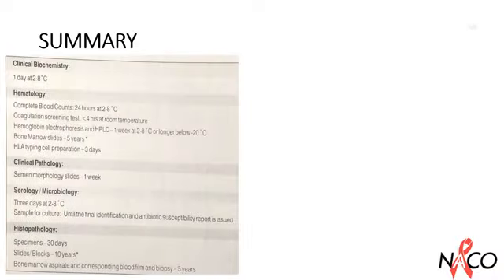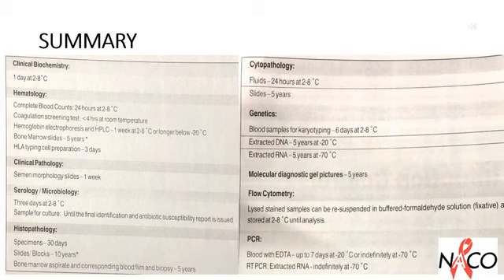Therefore, to summarize, the suggested sample retention period as defined in NABL 112 has to be followed by all laboratories.